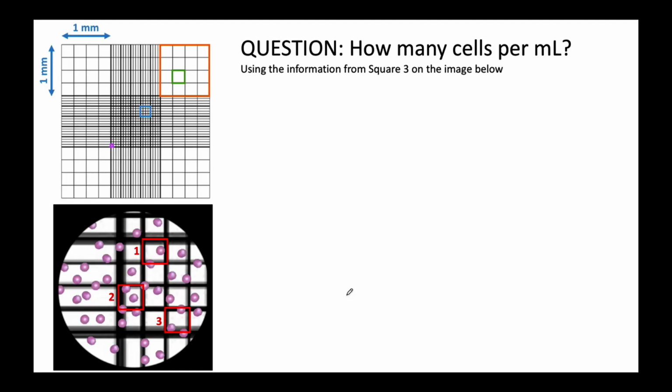So one of the things we're going to ask you to do in these practicals is to use a hemocytometer to calculate the density of cells. When you look at something under a hemocytometer, you'll get an image that looks like this. I've just mocked one up here. You've got our individual cells across this grid pattern, and the hemocytometer has a very distinctive grid pattern that's always set out in the way above.